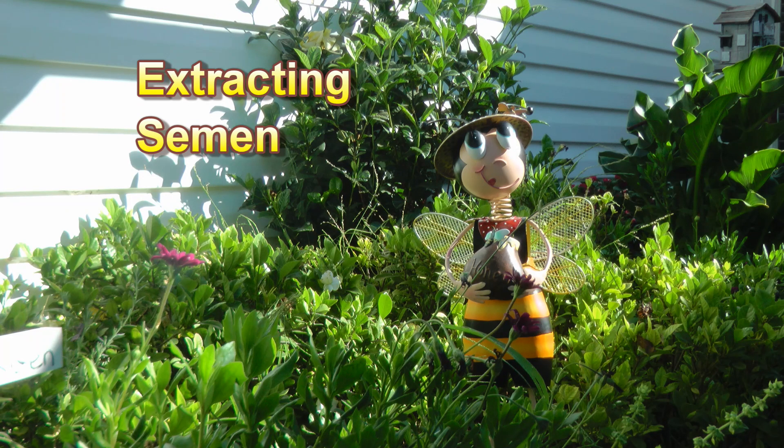Bill shows us how he extracts semen. He does this by squeezing the drone's abdomen until he ejaculates. It takes the semen from several drones to inseminate just one queen.